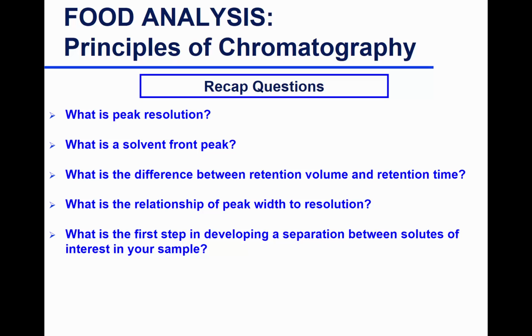How sharp the peak is, whether or not those match with one another? Perfect. In simple terms, how sharp the peak is, and the sharper it is, the more the chances of separating it from other components. Okay, so resolution is basically resolution of compounds or separation of compounds from each other.